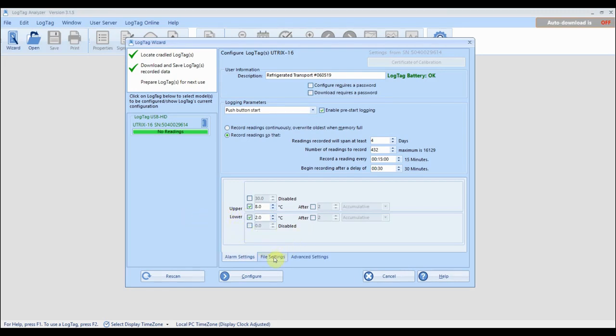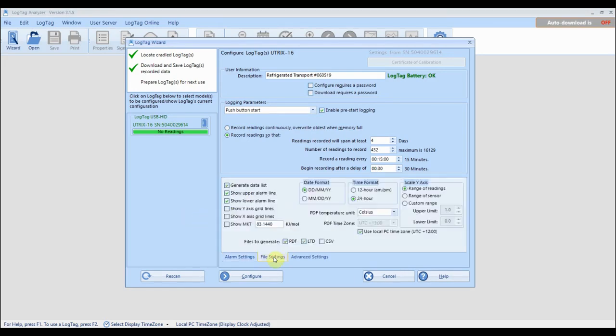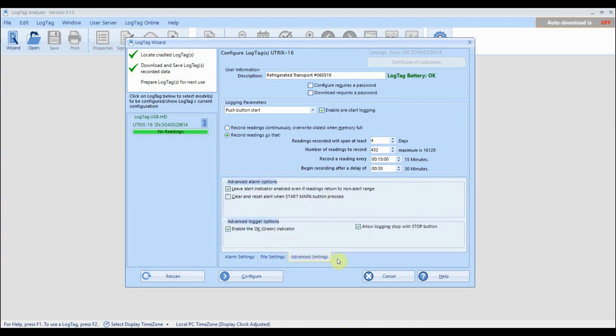Finally, there are additional options available on most loggers by clicking on a tab and customizing the settings to meet your requirements.